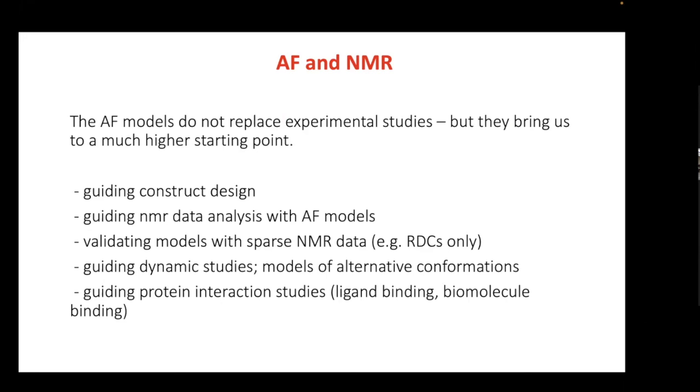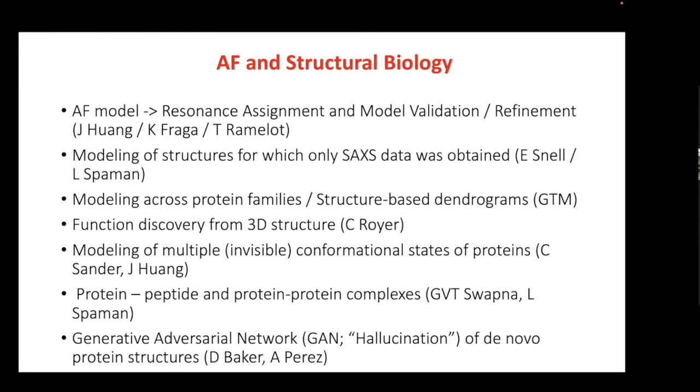For example, as we heard about with the SARS coronavirus MPRO, where RDCs and some NOEs are used to validate the models, guiding dynamic studies by providing models of alternative conformations, and of course, guiding protein interaction studies like ligand binding and biomolecular binding. So I think the point of this, and to lead into the discussion, is that AlphaFold doesn't replace experimental work, it enhances experimental work. And I think that point was also made earlier.